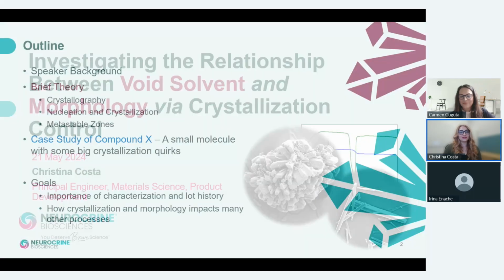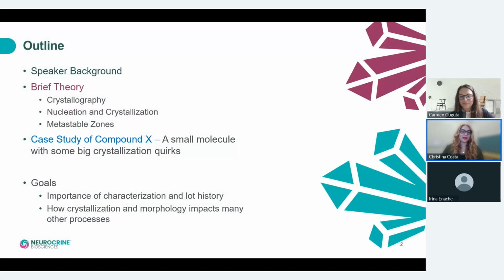So just a quick outline. I'll give a little bit of my own background, although Carmen already did a good job of doing that. I'll go through some brief theory, just really general background information on some basics of crystallography, nucleation and crystallization, and metastable zones, just to give us a good background and foundation to understand the case study that I'll discuss in the second half, which we'll call Compound X, which is a small molecule that has some interesting crystallization characteristics.